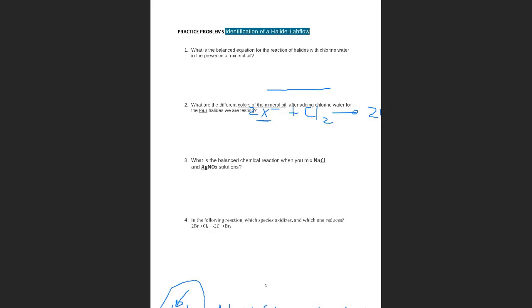Do you have any questions about this experiment? For the first equation, because I came in late, sorry. So basically what you're doing, you're adding in this ammonia, and then the ammonia is going to cause it to dissolve. Exactly.